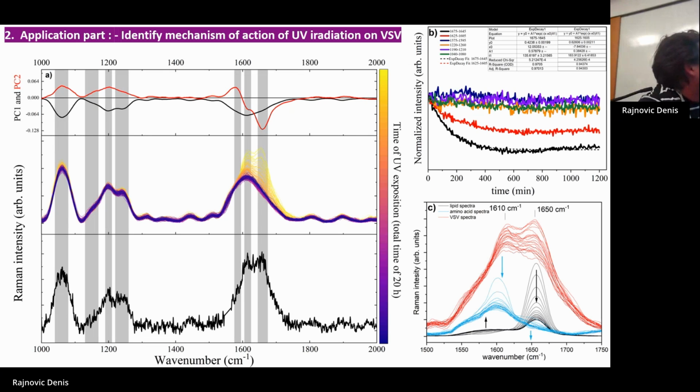So this is the type of study that can be done with UV radiation and identifying spectral markers.